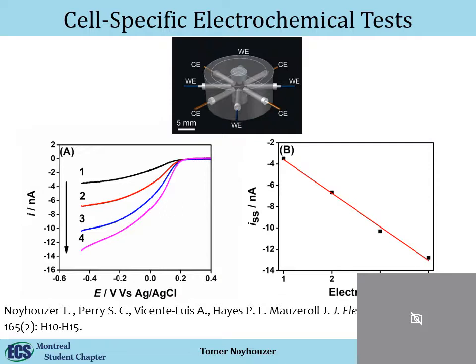So this is a cell that I designed for UMEs, ultra micro electrodes. I wanted to design a cell that can use UME and can use UME as an array. So I added 4 working electrodes and 4 counter electrodes. And you can see it's working, counter, working, counter, working, counter, working, counter, because I wanted to have them symmetrical. I didn't want to have all the working on one side and all the counter on the other. So they're dispersed symmetrically in the flow cell.